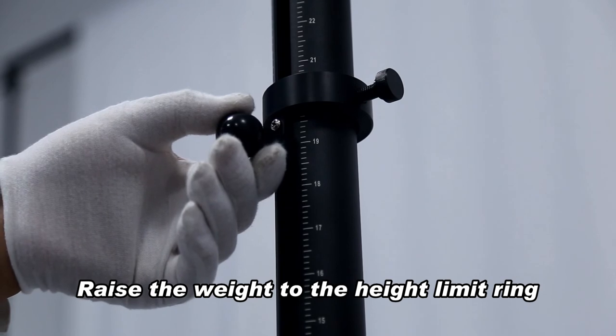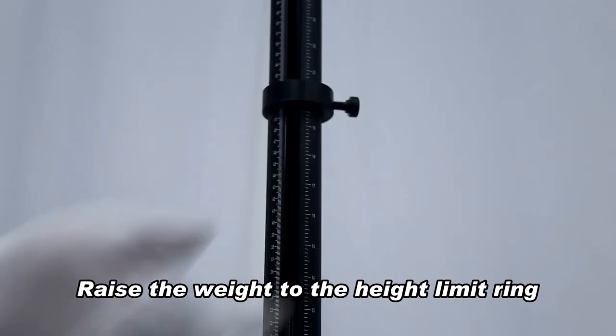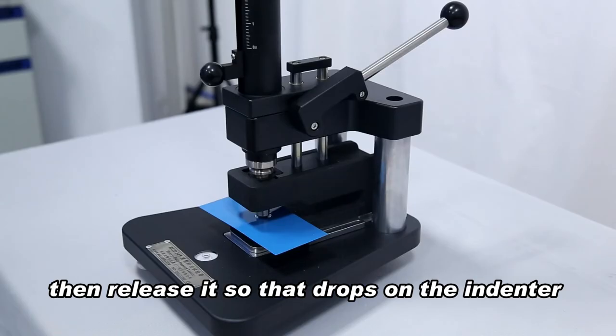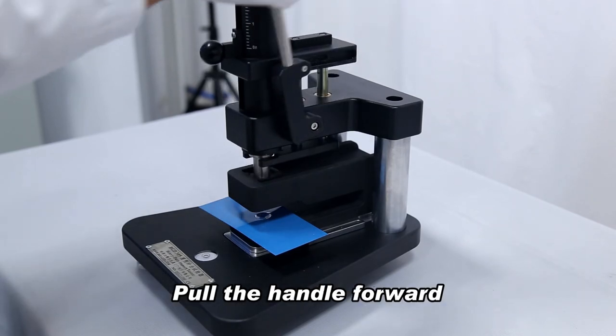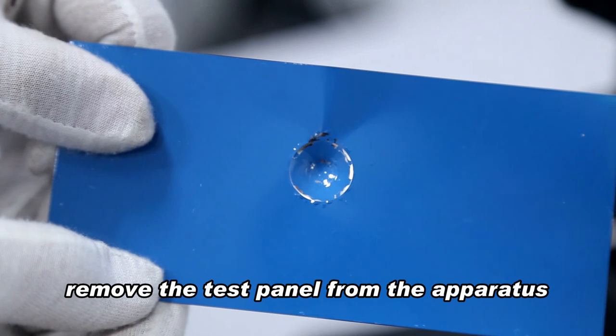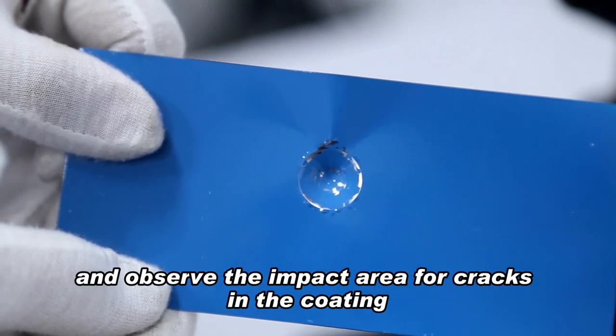Now raise the weight to the height limit ring, then release it so that it drops on the indenter. Pull the handle forward, remove the test panel from the apparatus, and observe the impact area for cracks in the coating.